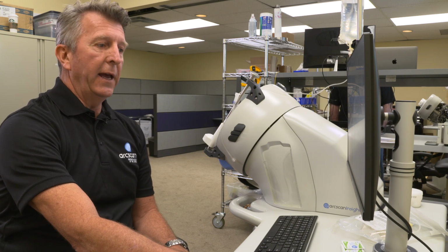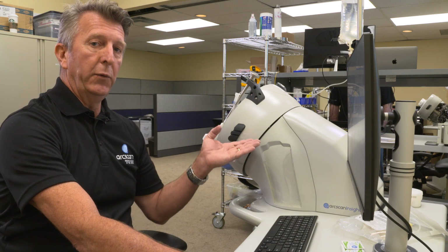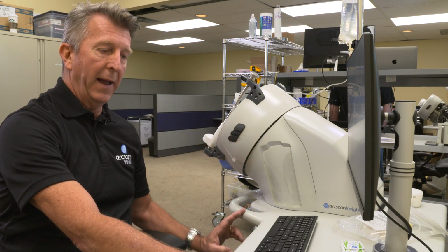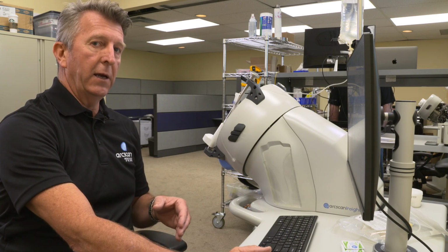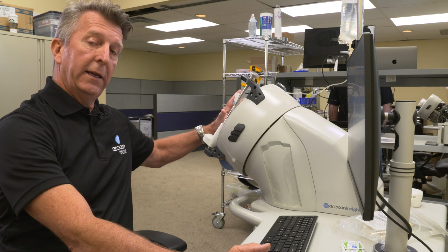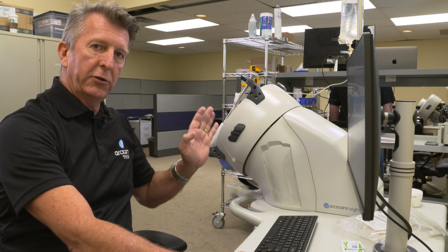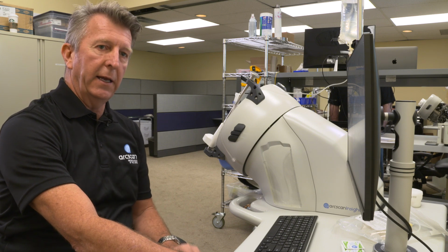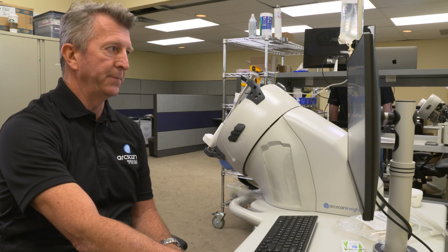Only at the end of the day would you click the drain, and that brings all the fluid out of the instrument module back down to the fluid reservoir down at the bottom. At the end of the day also, you go ahead and leave the eye seal off, leave the instrument wide open so that it can just air dry. Don't worry about things getting in. The filter would take out any little particulate that might enter into the system.